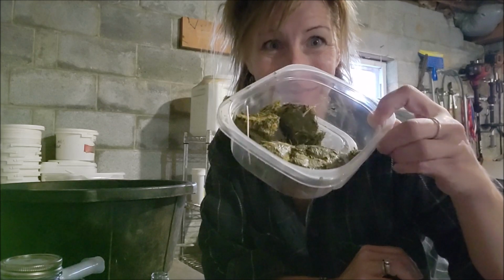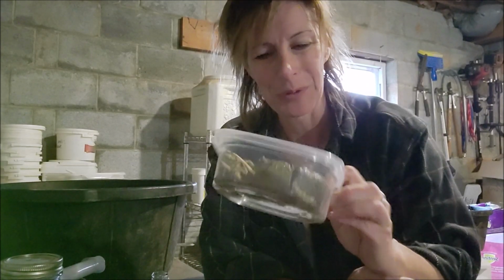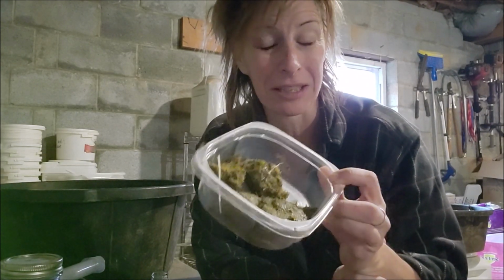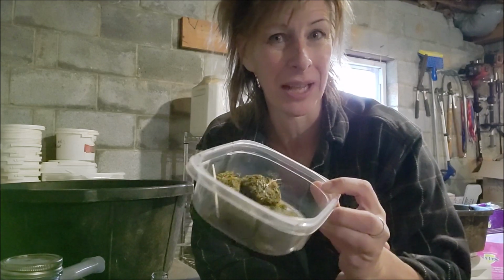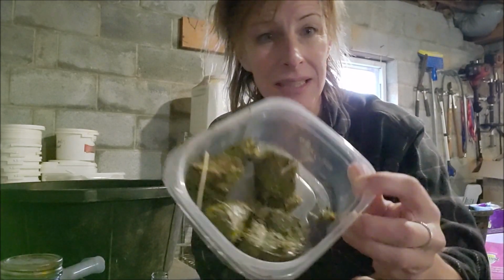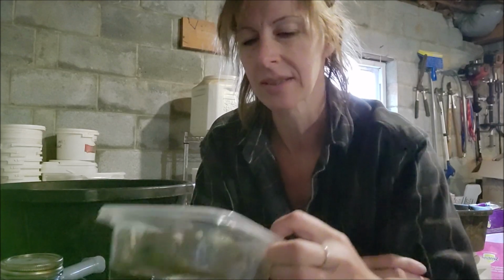So, speaking of crap, I happen to have some. This is fecal day. So this was collected fresh this morning. He is defecating perfectly. He's giving me 8 to 9 poops every night, which is good. You want to have about an hour to an hour and a half between poops. So he's doing great. These look really, really nice. I know, I'm sorry. Count yourself lucky, you can't smell this.